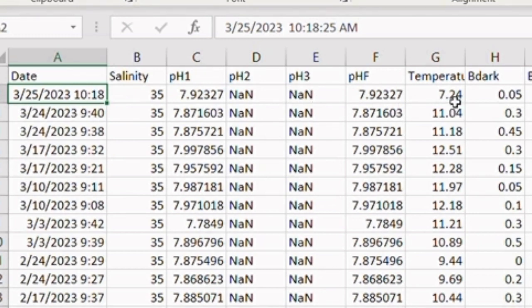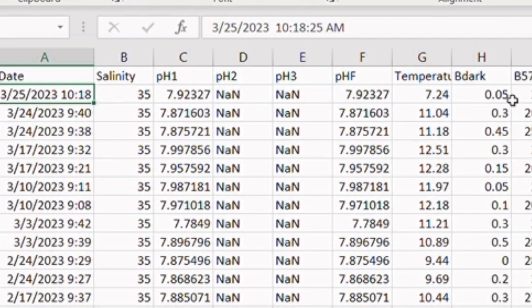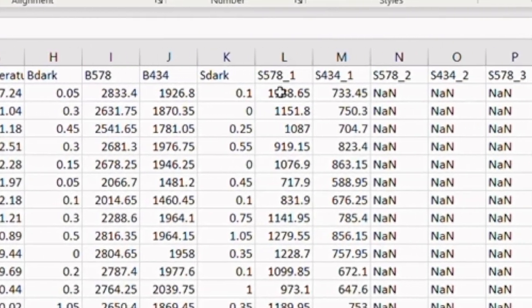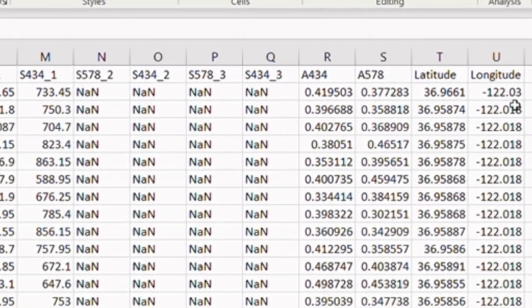Also check on the temperature, and also the blank signals and the sample signals, and also the latitude and longitude of the measurement.